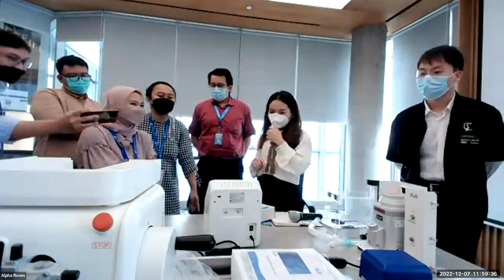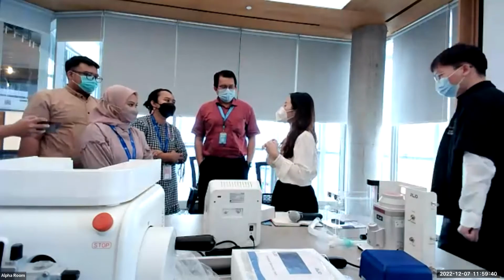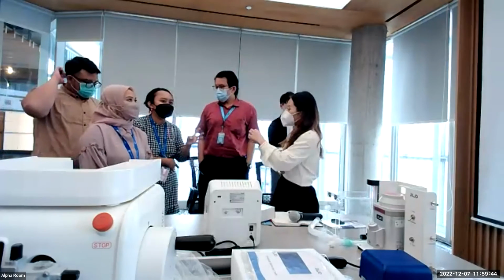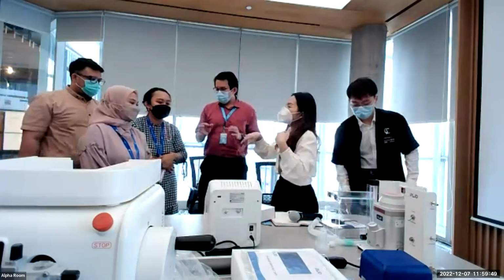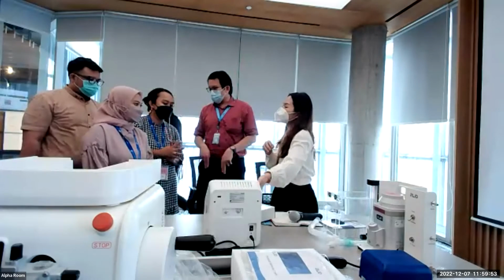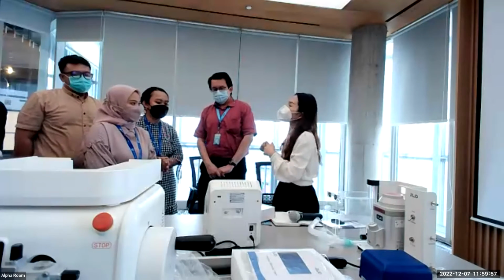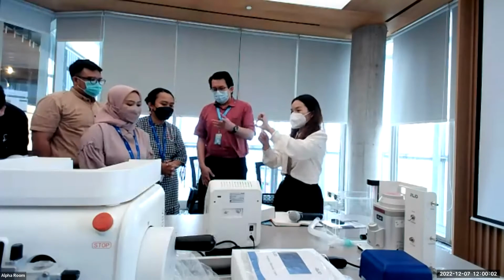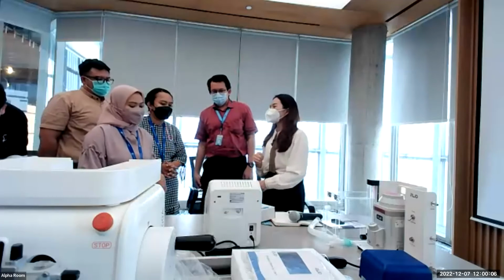And the range is 4 micrometer to 60 micrometer. I mean the size of cell. This is just including this range that this machine can count. 4 to 60 micrometer. Yeah. Of the cell. The size.